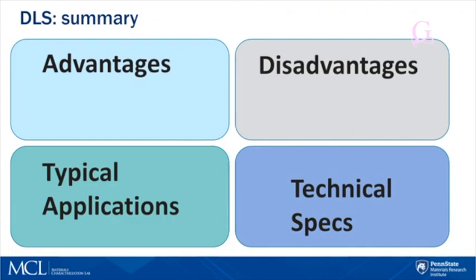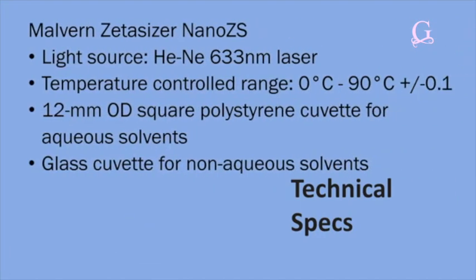Finally, these are technical specifications for our DLS system, Malvern Zetasizer, that we have at MCL, and you can read more in detail on our website.